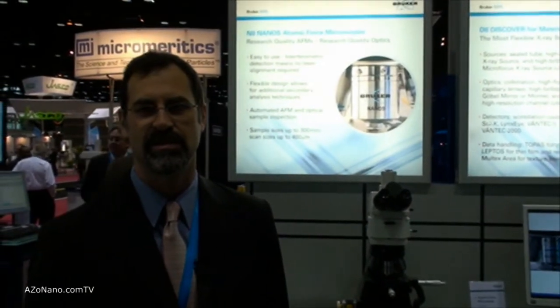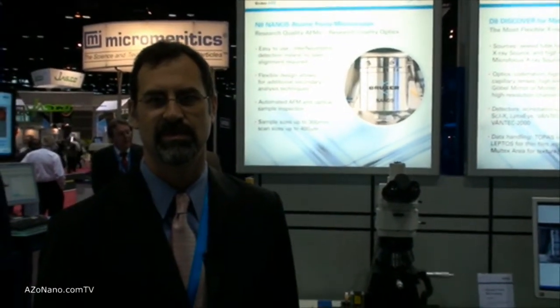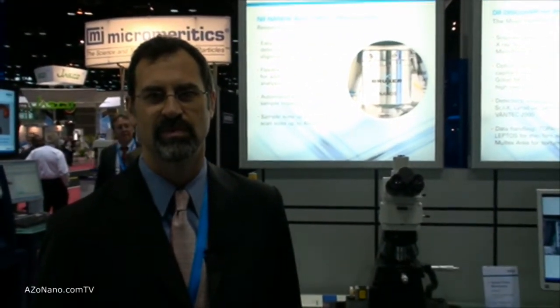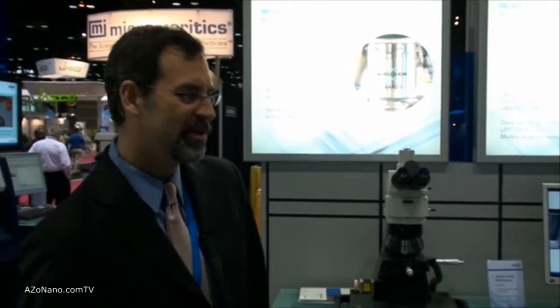This is Cameron Chai here from azonano.com and I'm speaking to Dave Sampson from Bruker and he's going to tell us about their NEOS Atomic Force Microscope. Welcome to the floor of PitCon.